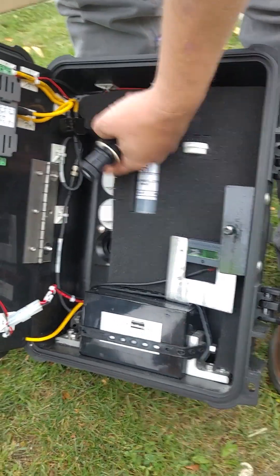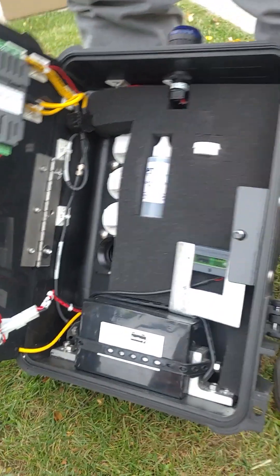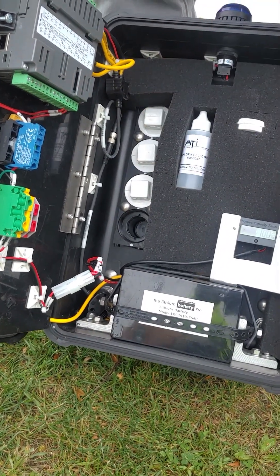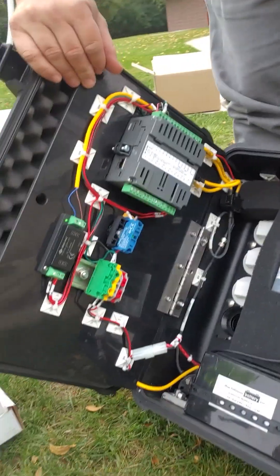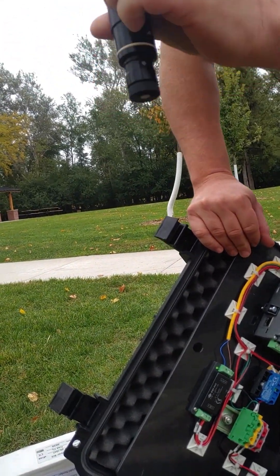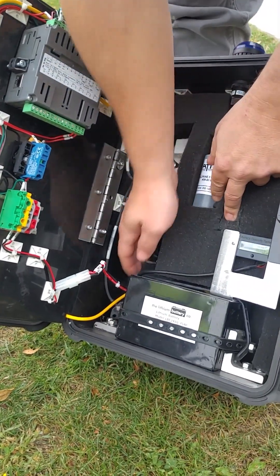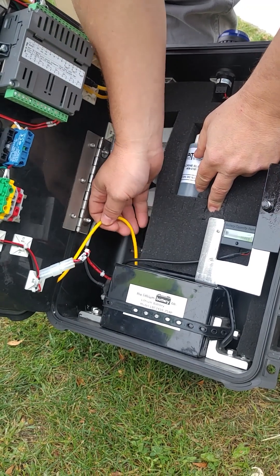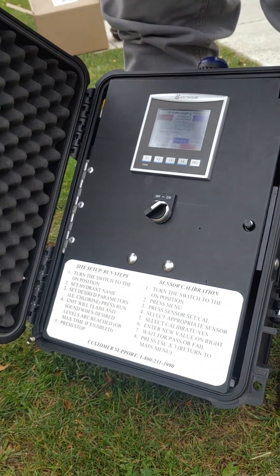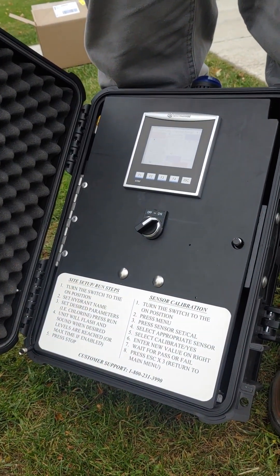Other hardware-wise, this is the new flow cell style I mentioned — if you ever wanted to add another sensor, all you've got to do is take the cap out. It's just got two pins, it slides in, turns, and the pins hold it from shooting out under pressure, then you plug in the cord. So say you want to test fluoride — you can just put a fluoride sensor in there.